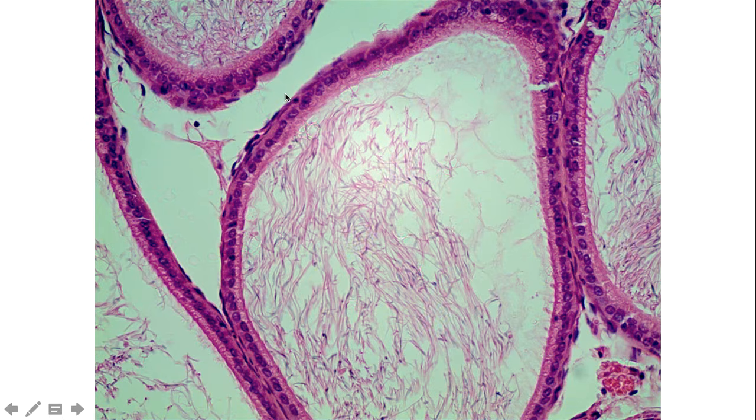If we look closely at one of these ducts, we can see some features that should hopefully distinguish it from the seminiferous tubules. One thing you'll notice is a lot of spermatozoa present within the lumen. So these again are moving through this long epididymis, acquiring the characteristics that allow these sperm to swim and fertilize an egg. The other thing you'll notice is the wall of this is going to be a pseudostratified columnar epithelium, and they're going to have these long microvilli or the stereocilia.